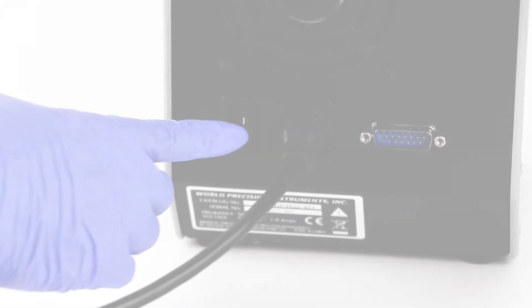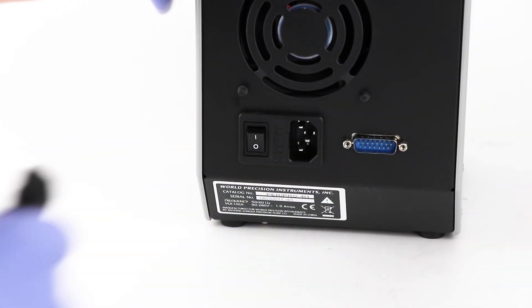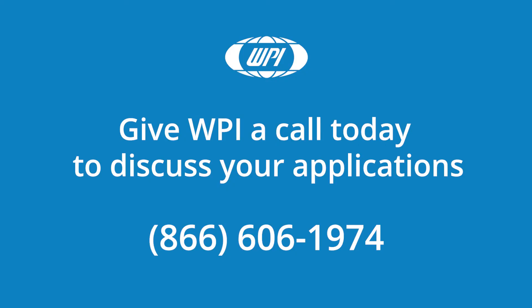And always turn off the power and unplug the power cord when you're changing the tubing. If you have any questions about your Peristar Pro, just give us a call.